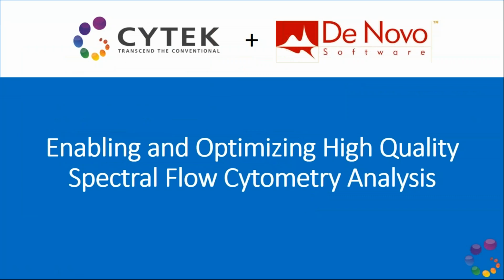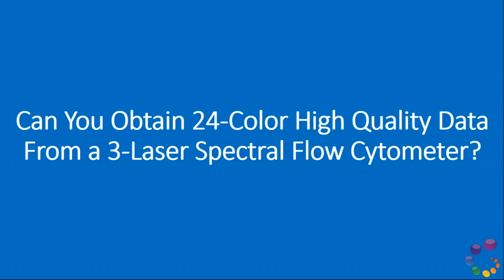Okay. Thank you, Sean. So to get things started, we can't get to all of Sean's exciting tools that he's going to demo for you in the FCS Express software until we have some great data to feed into it. So to start things off, I want to pose one question for you. Can you obtain 24-color, high-quality data from a 3-laser spectral flow cytometer? The answer, of course, is yes.